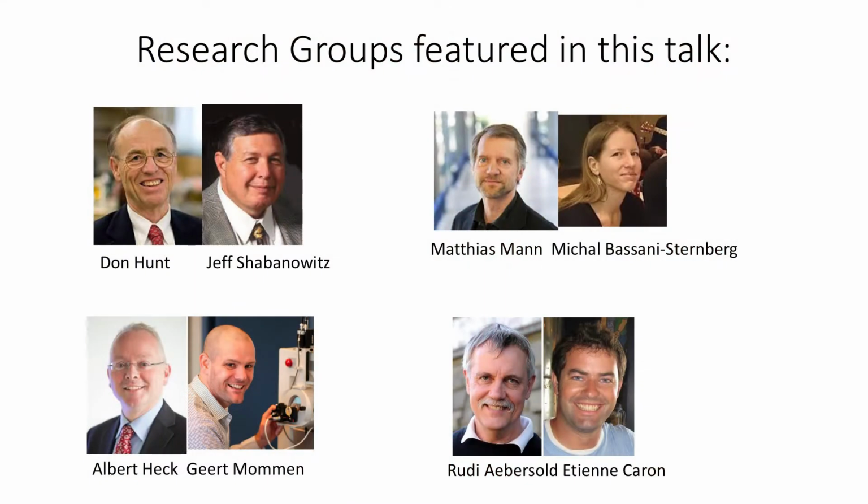I got my PhD from Don Hunt, and when I told Don Hunt that I'm giving a talk here, I told you already you should invite Don. So Don was nice enough to send me a couple of his historic slides that I'm using in this talk. But I'm also going to discuss the project that the previous speaker already mentioned, this paper I'm also talking about. So these are all mass spec-centric papers that are talking about detecting HLA peptides. So Don really pioneered this field, and recently everyone is working on those.